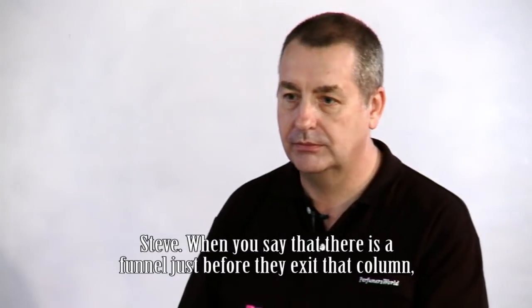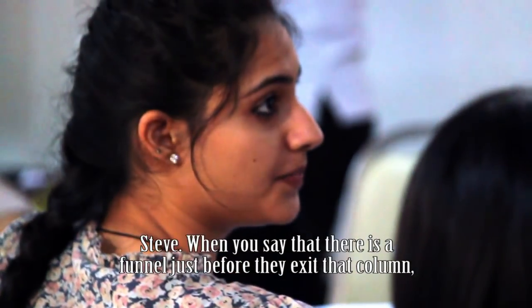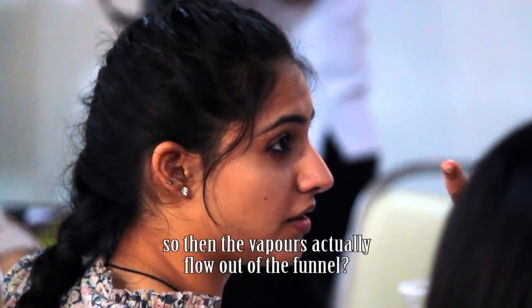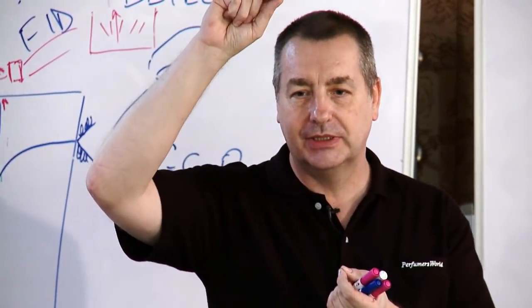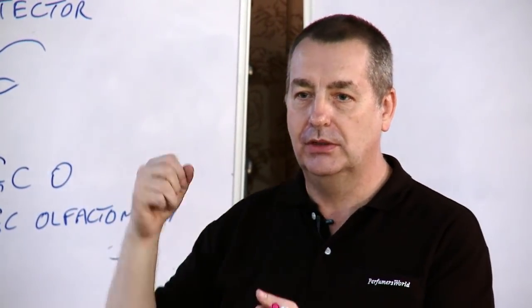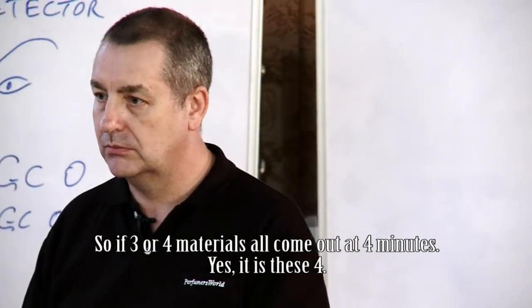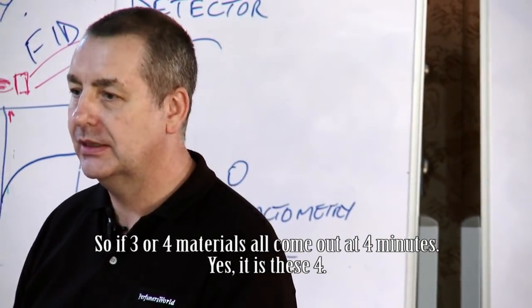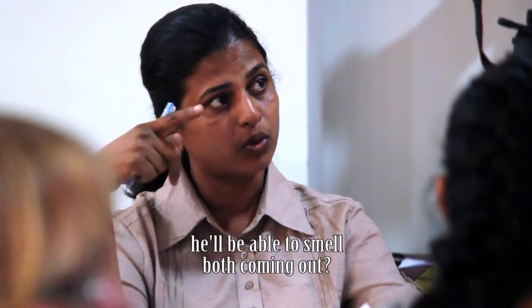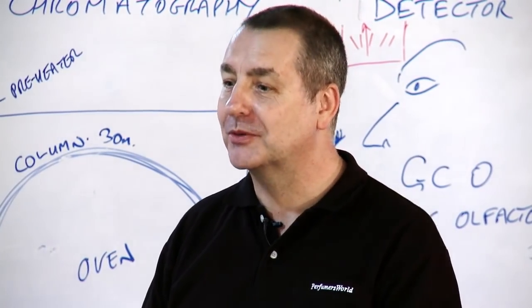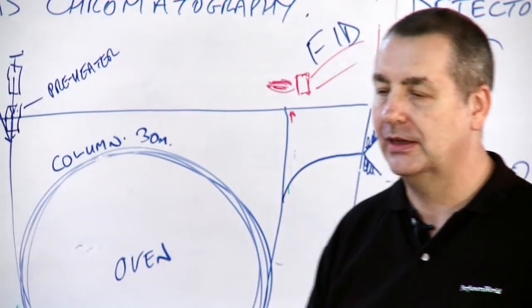When you say that there's a funnel just before they exit that column, so the vapors actually flow out of the funnel? Yes. So, this is called a splitter and it's designed so that 50% goes up to the FID and 50% goes out to the funnel, the GCO. Three or four materials will come out in four minutes. I guess it is these four. I think there are two of them in that. So, if the perfumer sits at the other end, he'll be able to smell both coming out? If they're mixed together. Yeah, then there's a problem, of course, because you've got a mixture.